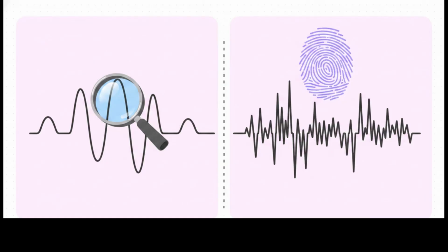This essentially gives us a map with two distinct halves on our x-axis, which measures wave number. From 4,000 down to 1,500, that's your functional group region. This is your primary hunting ground for identifying specific bonds. But below 1,500, that's the complex fingerprint region. So the strategy is, find your suspect on the left, but absolutely confirm their exact identity using the unique fingerprint on the right by comparing it to a known reference spectrum.